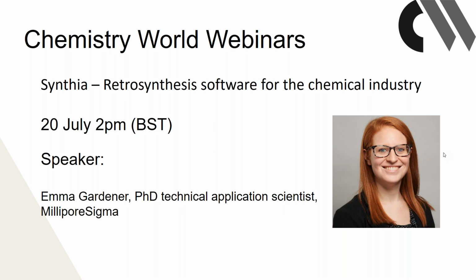Well, today we're looking at Synthia retrosynthesis software for the chemical industry. We're seeing a live demonstration of Synthia, which is software that can make your time in the lab safer and more efficient. By the time we're done, in about an hour's time, we will have seen a new way to use retrosynthesis to accelerate your research.